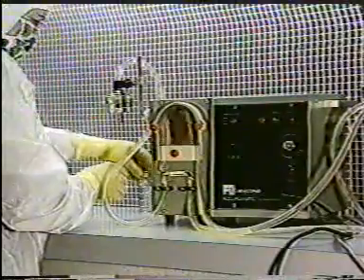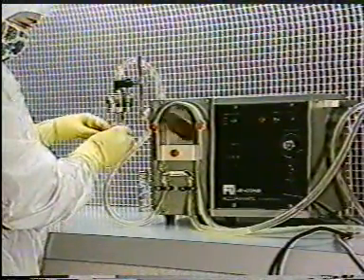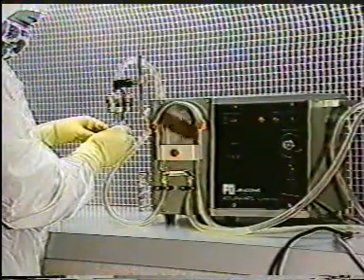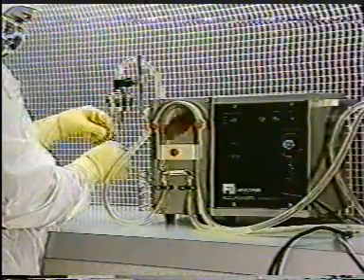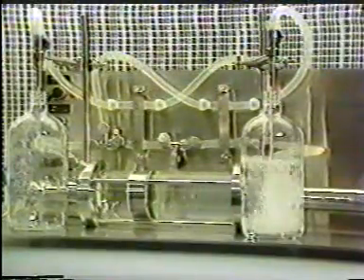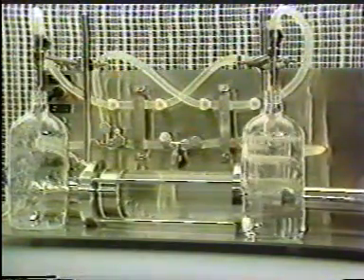For large volumes, a peristaltic pump may be used. Fluid is pumped through a flexible tube by a roller device. The volume delivered is determined by a control which varies the time the delivery gate is open. For large volumes, other machines are available which can deliver volumes up to 1 litre.